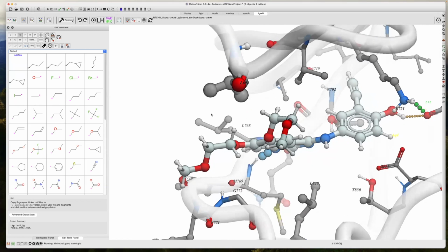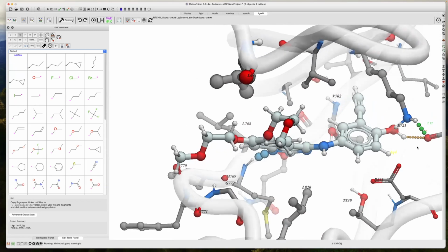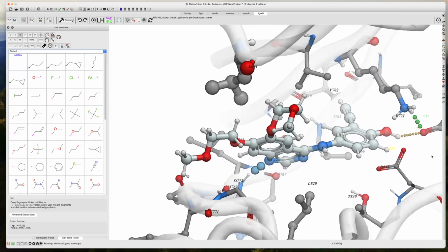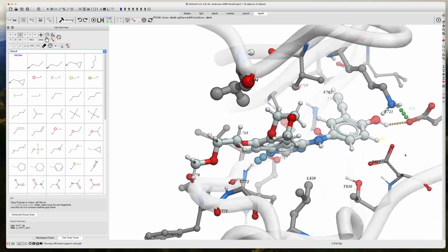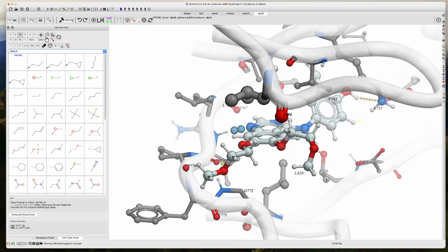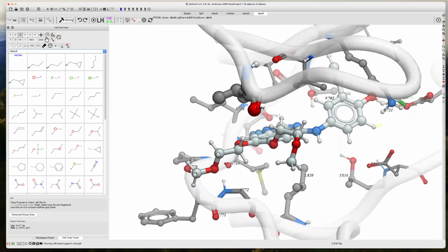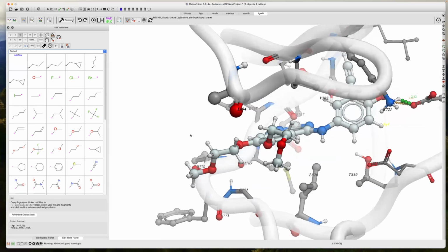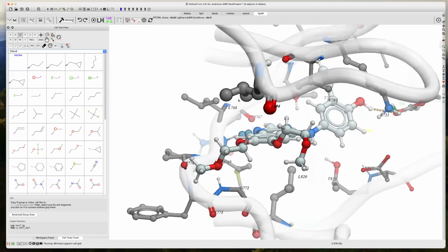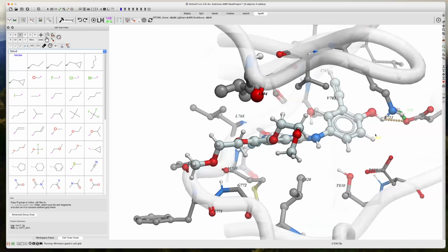You can see with that modification, we added a hydrogen bond with this group, part of the DFG region. So at the moment, we're looking at the orientation of this in terms of kinases. You have your adenine binding site here. You have the solvent exposed region here, where usually the ATP phosphates are and the sugars. And then at the back, we have the hydrophobic site, and there's an additional hydrophobic site here, which we can see. So we're making modifications in this region to start with.